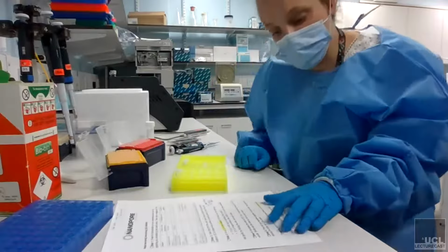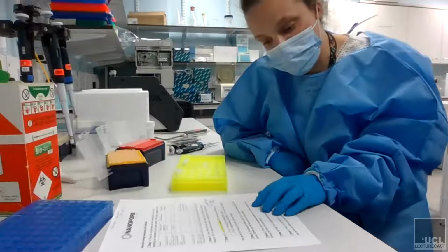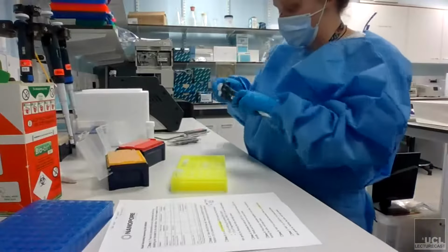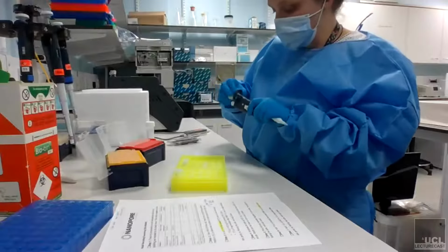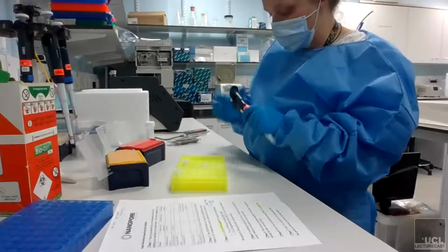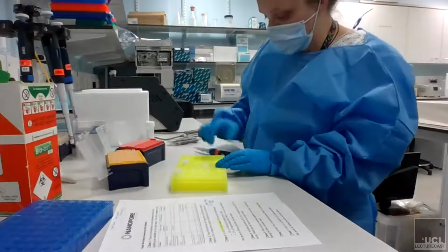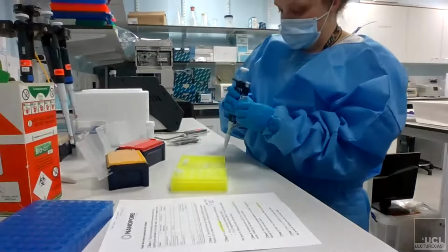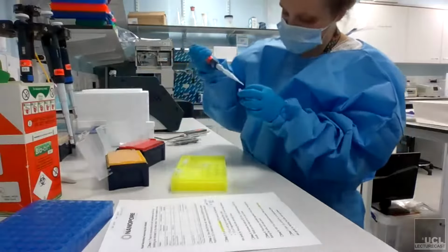So now we're going to pool all of our samples together in one tube and then gently mix it. So I shall do that now. You can just pool them all together in one of the tubes that they're in. I'm just going to pool them in number one. Again, it's up to you how you want to pool them.